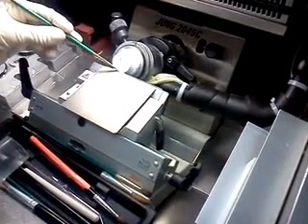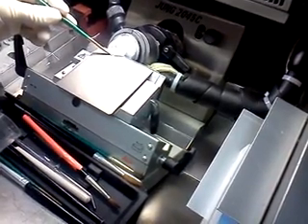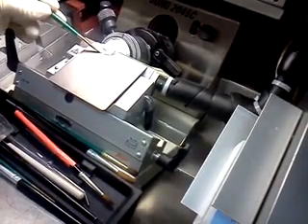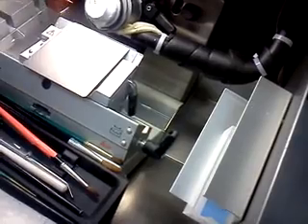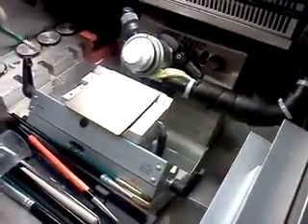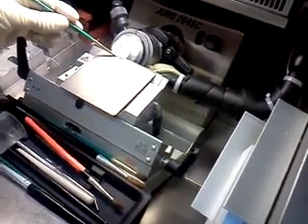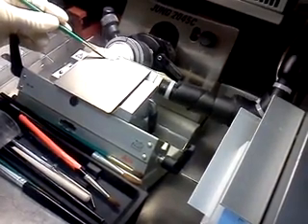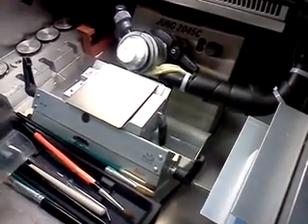About the width that you're going to have. And now this is where we're going to determine if the temperature is too cold. See how that broke right there? That's because it's hard to distinguish between the OCT and the tissue, and I suspect this temperature is wrong. Okay. I could go look it up, but I'm not going to, because I want us to find out empirically what works best. This temperature, I think, works good for olfactory, but as I recall, maybe too cold. That's what I meant by chatter and all that stuff. And make holes, and that's the hard part about sectioning, getting that right.